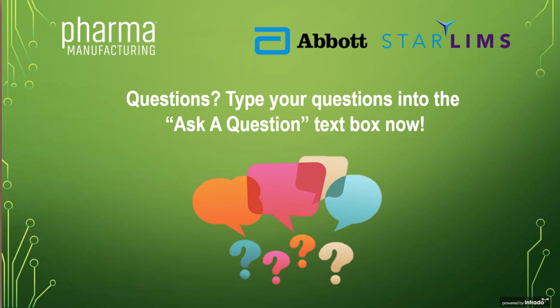Okay, great. Question for either of you. What is the most important value added in terms of processing labs compared to ERP/SAP, since SAP QC module can provide the QC services? I can take that one, and I consider that SAP or any ERP system complements STARLIMS or a Laboratory Information Management System.